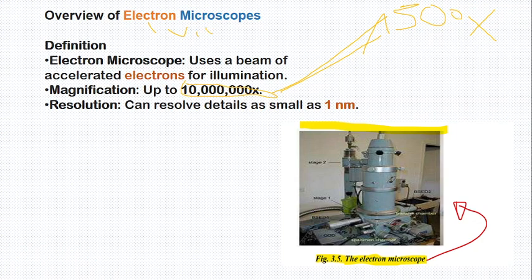Remember in the previous unit, we said that viruses are seen only under the electron microscope. It means that with the help of this electron microscope, you can see very, very small things, because the electron microscope has high magnification. It has a high power of increasing the image. Okay. I hope you are understanding. Also their resolution, okay, appreciate their resolution. Resolution is 1 nanometer. I hope those who are doing PCB understand those nanometers and micrometers better than me. They also have higher resolution power than light microscopy.